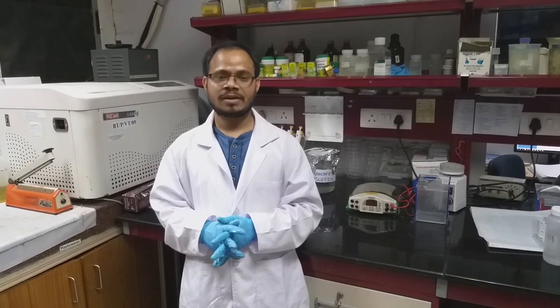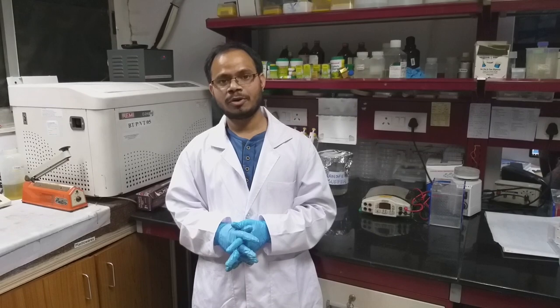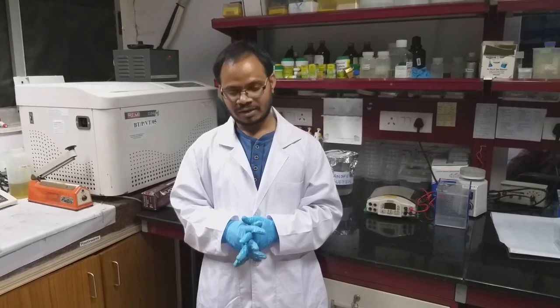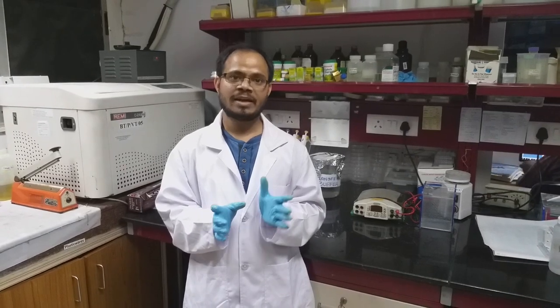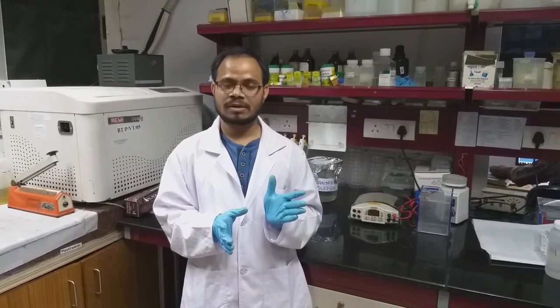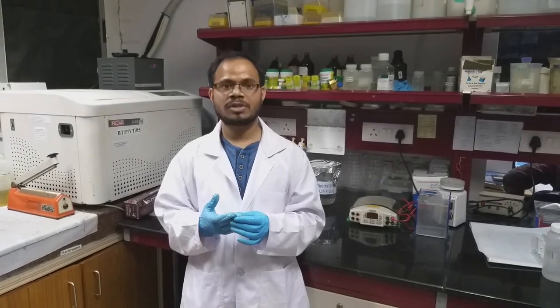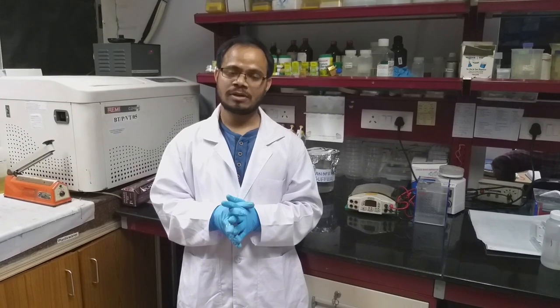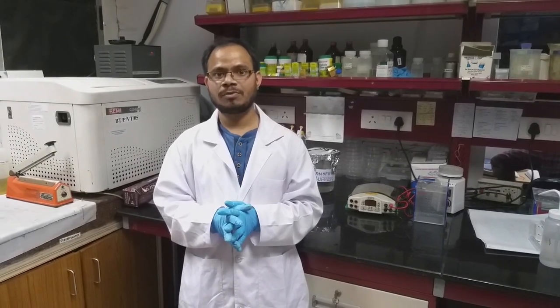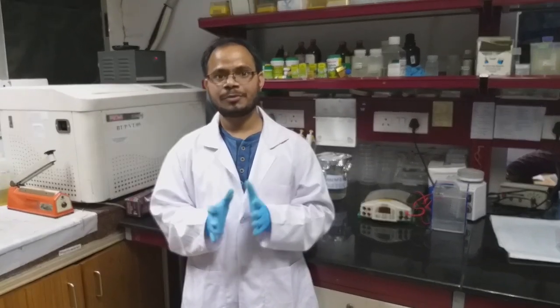The Western blot transfer depends on the efficiency, how precisely you are doing the transfer. For example, you should not use your bare hands while handling the blot or gel. Whatever proteins are present on your fingers will be transferred onto the gel or membrane, which will give high background during development of the blot. So always use gloves.